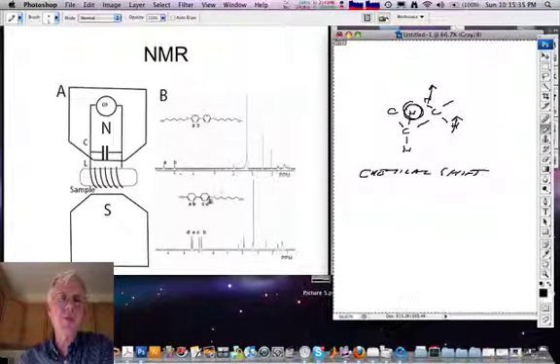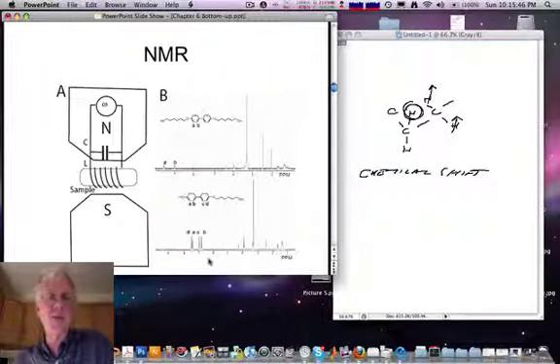However, in this molecule down below, where this chain has not been added, these protons are now all non-equivalent, and so now we see 4 peaks. So NMR can tell us about the structure we've synthesized with exquisite precision.